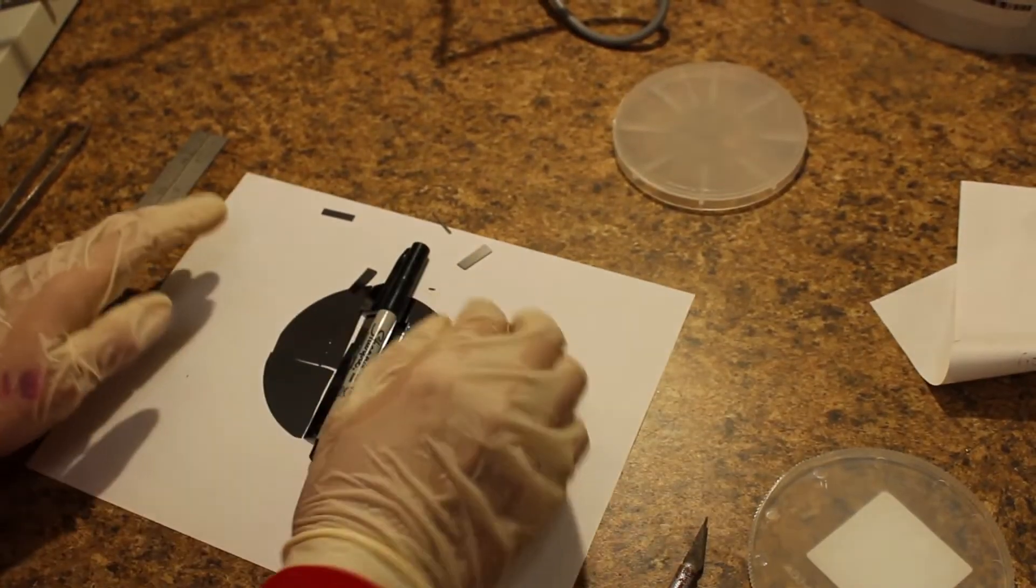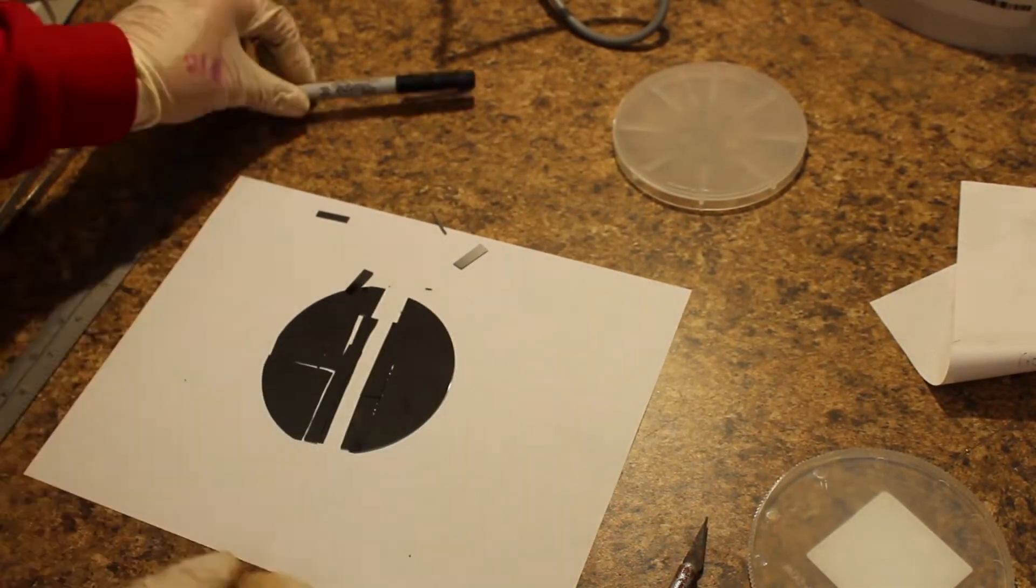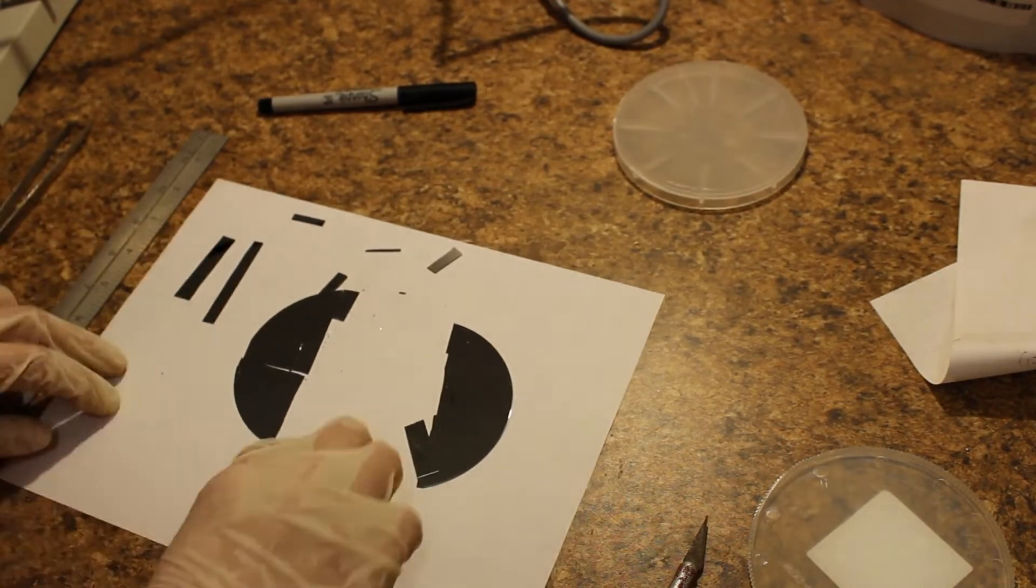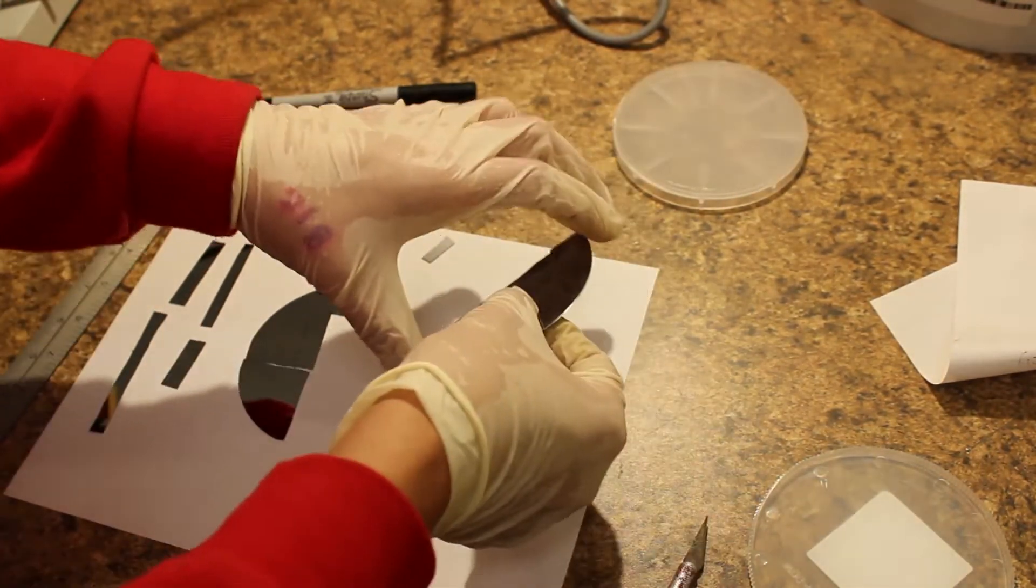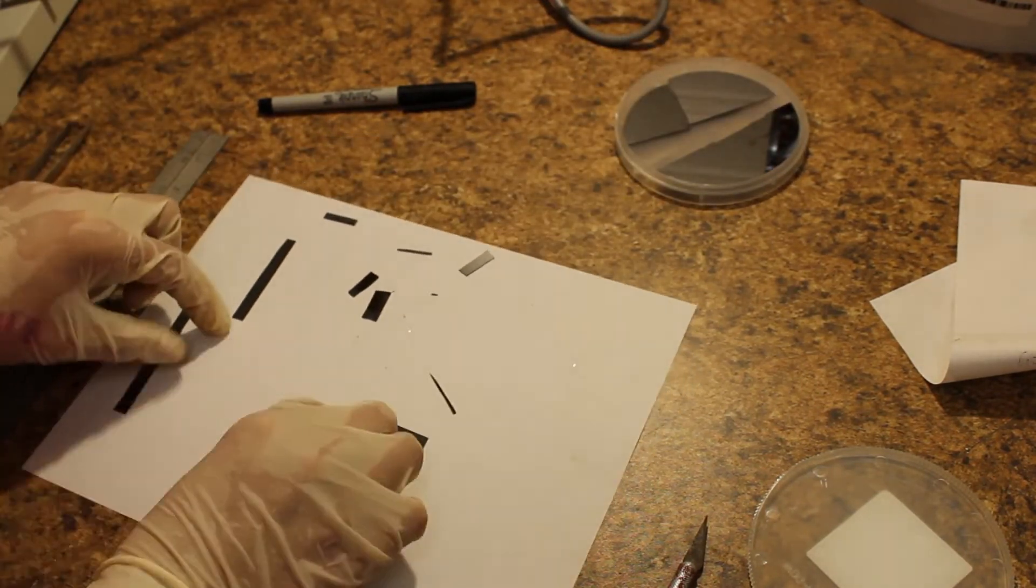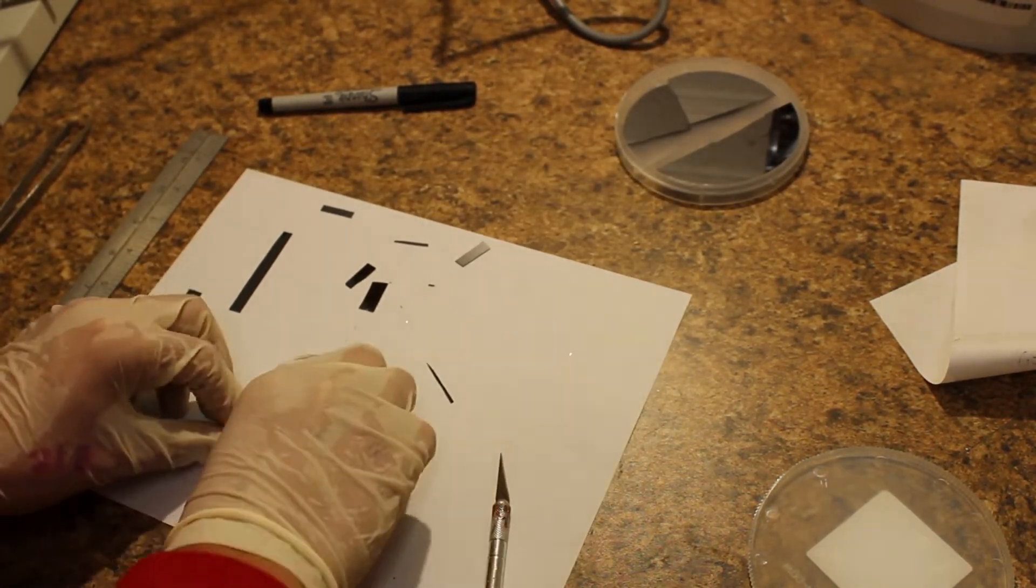I broke the wafer perpendicular to the flat. This is important because it allows us to break across the lattice lines. This gives us a very clean break through the wafer due to the wafer being one large crystal of silicon. Afterwards I break my pieces into smaller rectangles that are perfect for our next step.